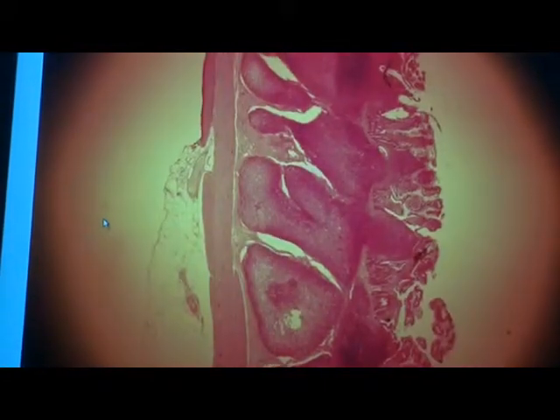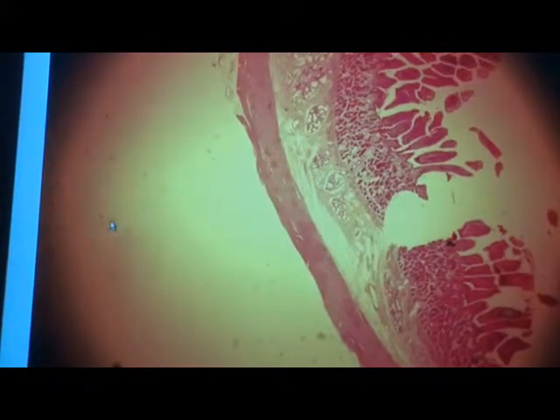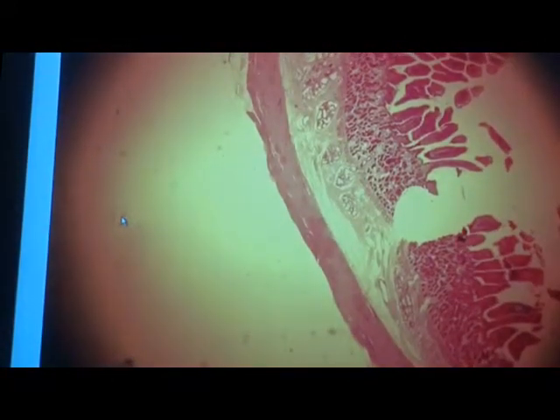Small intestine. There are 3 slices of small intestine here. Duodenum, jejunum, and ileum. You've got to be able to tell what's what. There's one slice. There's another slice. There's another slice. Doesn't hurt to be repetitive.